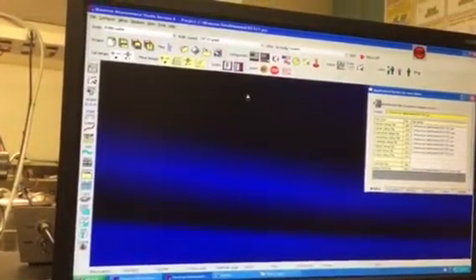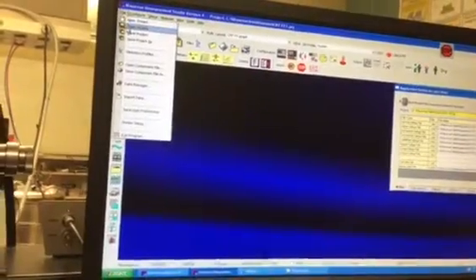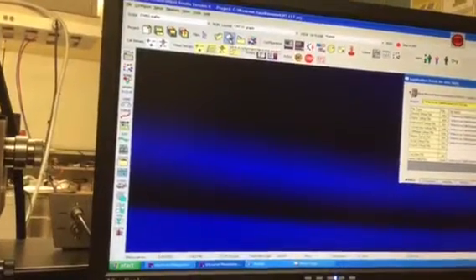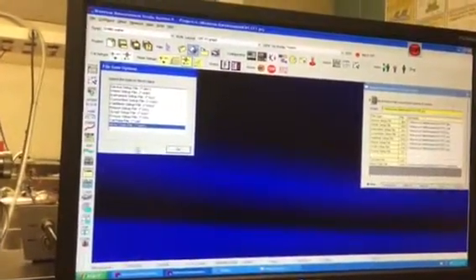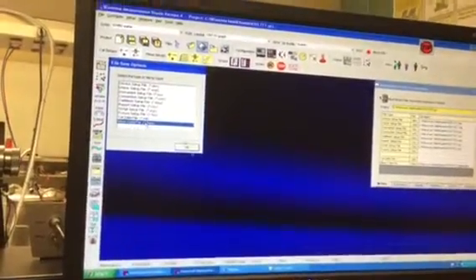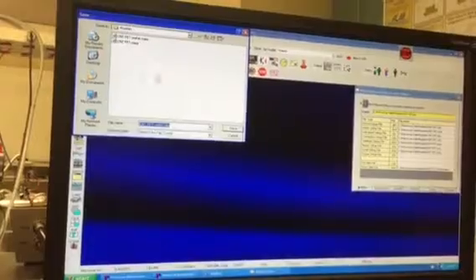Okay, so now you can go ahead and, why don't you save it first? Why don't you try to save it from the toolbar? Let's see if we can find this toolbar, or the icons. Once you get used to it, the icons will be quicker. So you're saving the whole project, so you want to be over in the other. Right, if you're just doing this, you're only saving the MEA file. So you can hit OK and then hit cancel next. So, cancel, cancel.